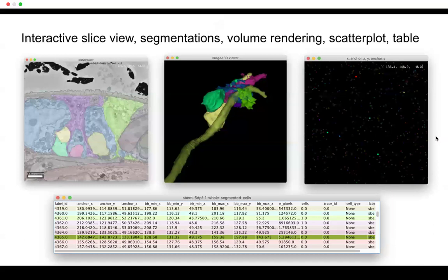So for example, clicking on the view that was just highlighted, you get all of these things popping up. So the viewer zooms in here to a specific region of the EM dataset that was interesting for this figure. And here you see actually the cell segmentation, which we did with some deep learning model. And the different cell segments have different colors. So this is a feature of MoBIE. And we can also render all the selected segments in the ImageJ 3D viewer. So you can also see how they look in 3D. So one cell apparently is very long.